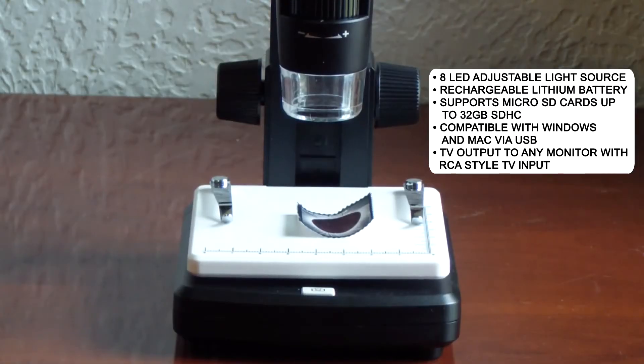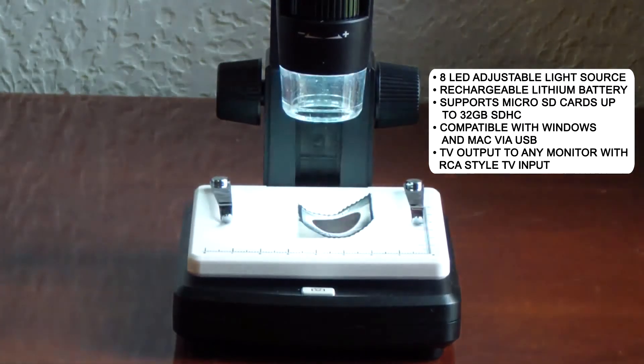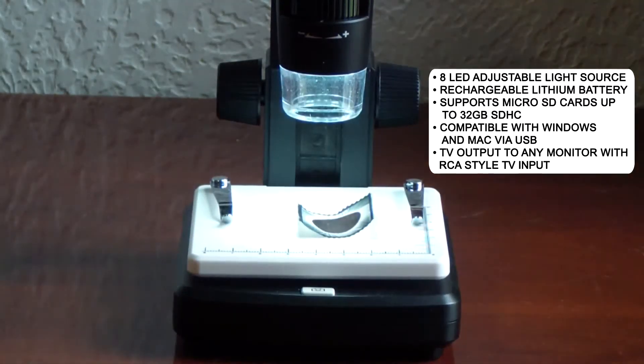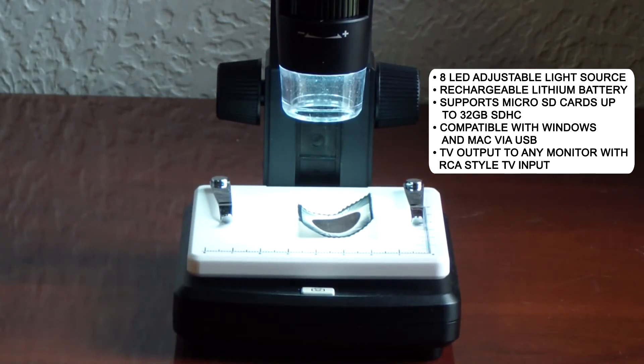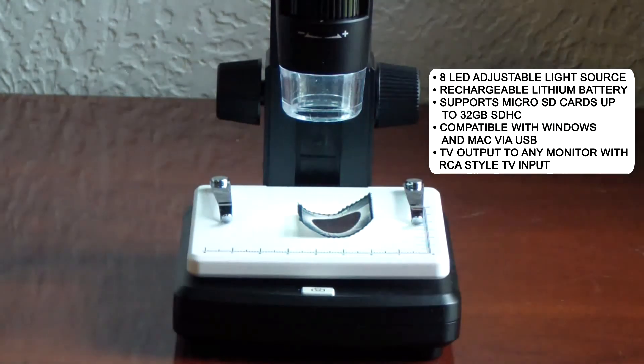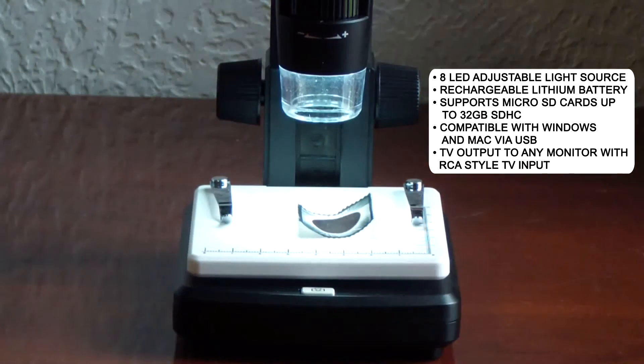The 8 adjustable LEDs focus light directly on your object of interest. The portable size and rechargeable battery enable you to use the microscope for observations out in the field.